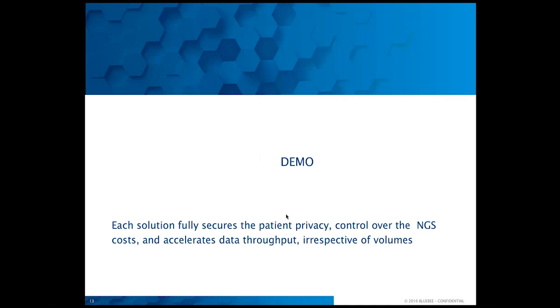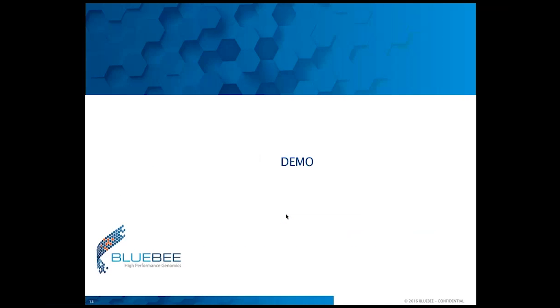So that's it from an introduction perspective. So the idea is that we would go now to a demo so that I can show you how everything works on a day-to-day basis.